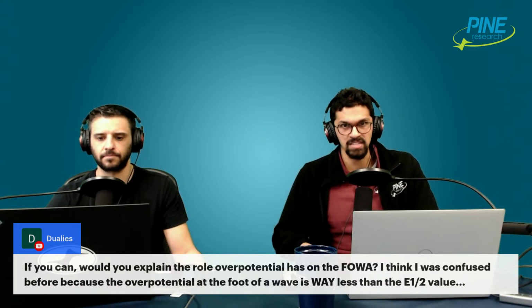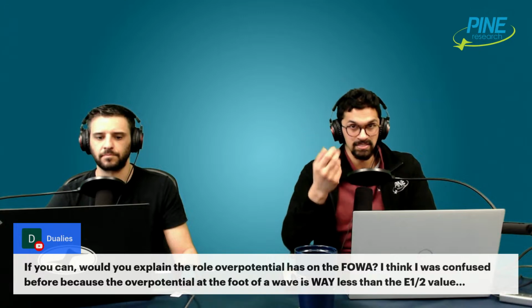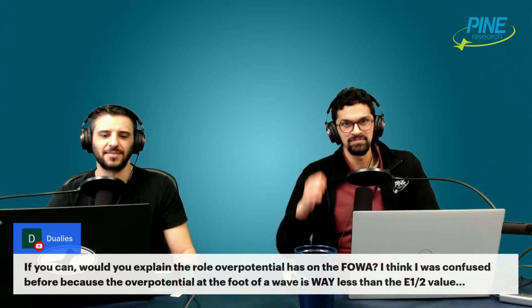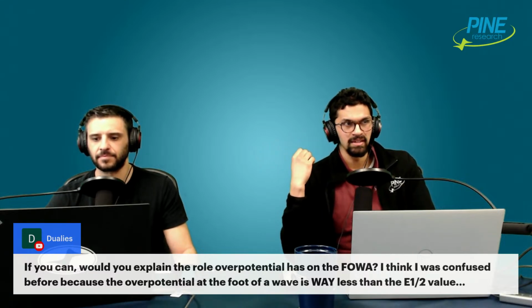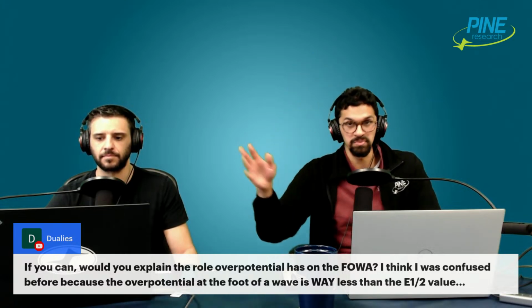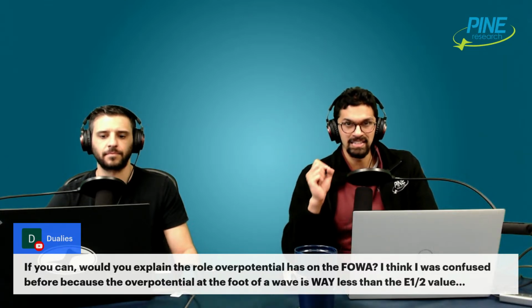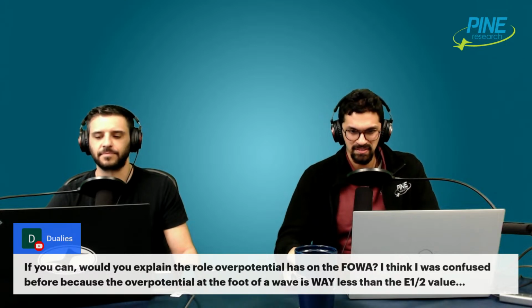But if you tried to do this experiment in the gas phase, your CVs would be sharp peaks that just have to do with the ionization energy of going from ruthenium 2+ to ruthenium 3+. Gas phase CV sounds amazing. Oh yeah, I mean it's probably a thing. All I'm saying is if you did an ionization reaction, which is what we're basically doing in electrochemistry, or an electron transfer, in the gas phase, it would be at a discrete point. But because we're in solution, we have a distribution. You have a whole cyclic voltammogram where current is flowing, which means electrons are being transferred at potentials that are not exactly E naught. So that's another deeper level if you want to understand what's happening.